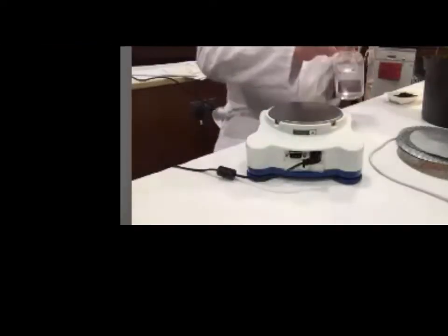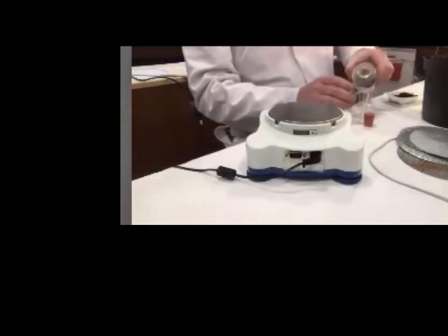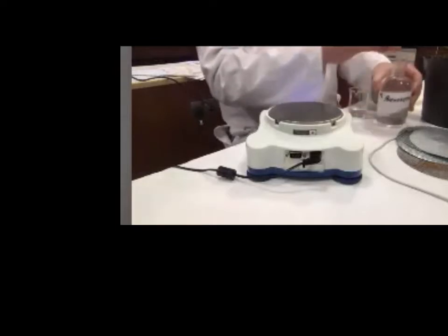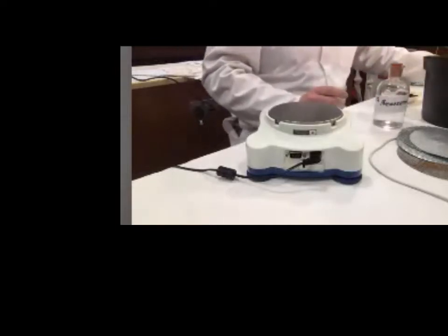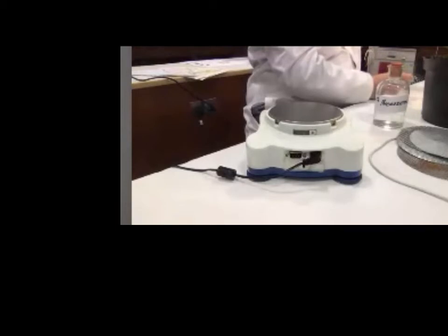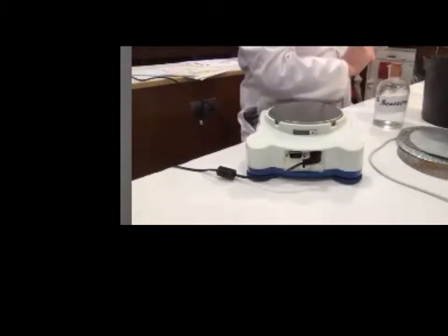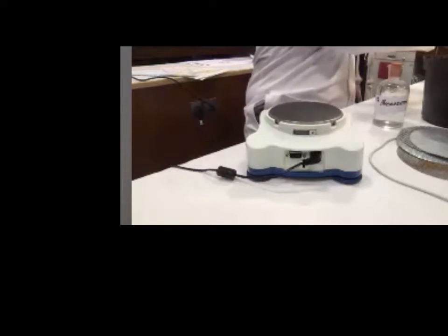Okay, so that's the preservative. Just a little bit at the bottom. If you're in a warm lab, that'll evaporate, so you will need to check it in the meantime. But we will lower this down. Now we put in our 50 grams, with the soil material going straight through, trying to get all 50 grams in. So just bring that over, show you.